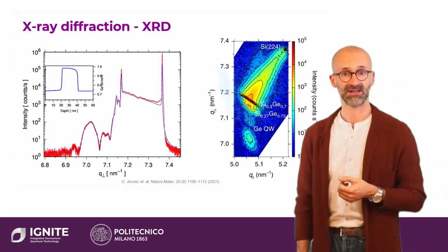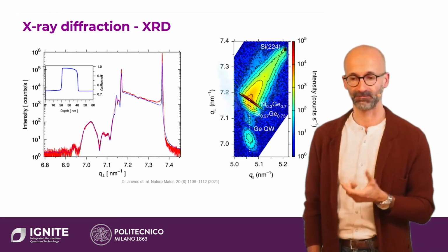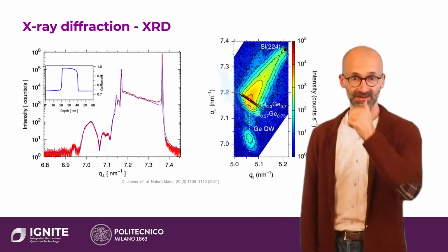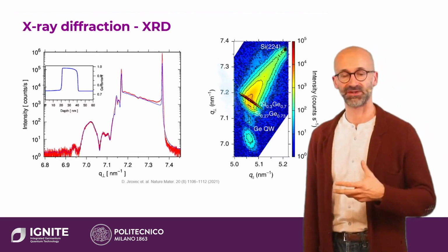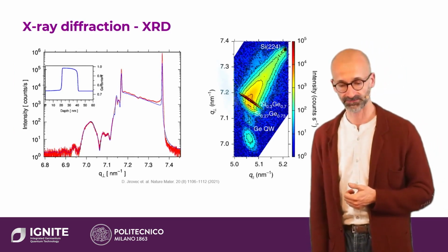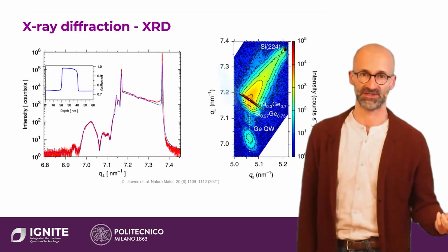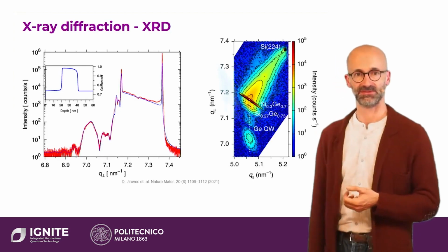If we do it at high resolution, which is now industrially and technically very easy, everything's easy if you have enough resources. Technically standard to make diffraction measurements at a high resolution that allow us to measure the amount of germanium in the silicon germanium. And this is the most fundamental thing to know, because if we want a silicon germanium virtual substrate that stops at 70%, we have to know how much gas to put in the chamber to give us 70% silicon germanium.